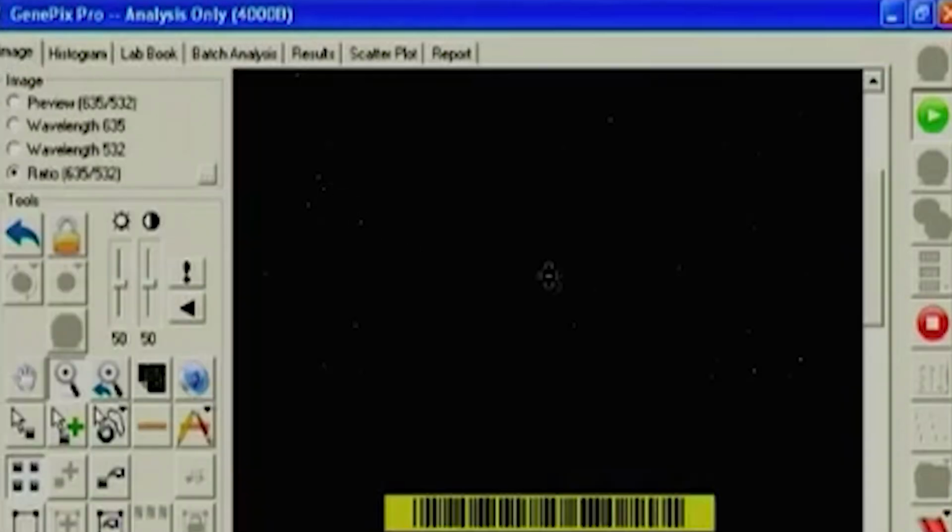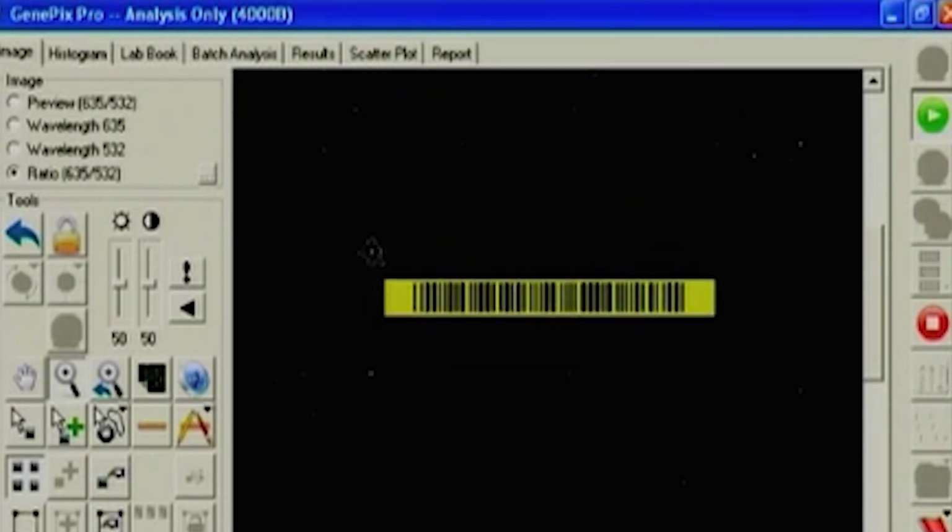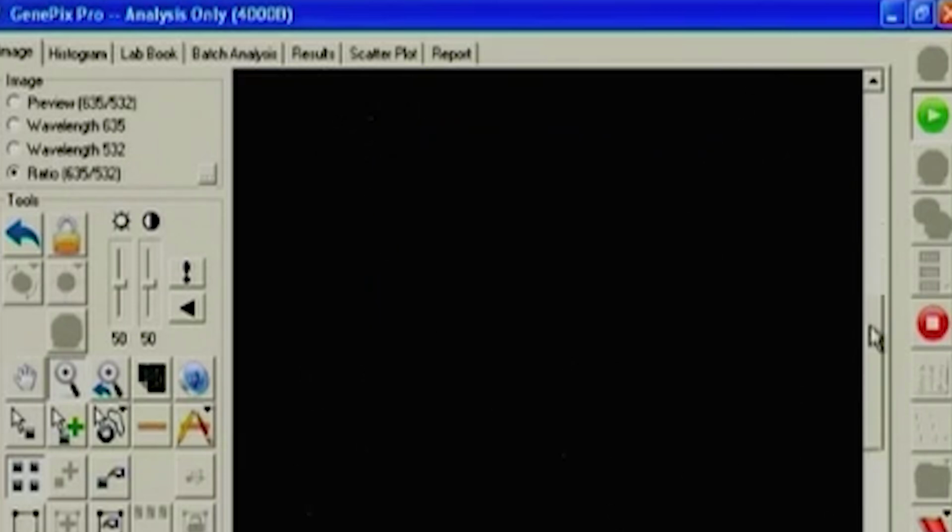So in this fashion, the image acquisition is happening. And we also give you a feature: in between the slides, usually people keep barcodes. Our system, GenePix Pro, is compatible with reading the internal barcodes, so that multiple scans are also possible. Nowadays each slide is coming with multiple arrays because of the variable densities. People are focusing on the custom type. So this can also be done with the new software upgrade developments.